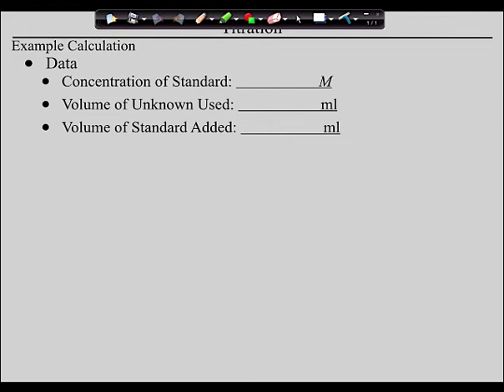All right, 2 years ago, I didn't have the money to buy these for my classes, and a couple of my AP students took the motor off of an old junked computer case, and they taped a magnet to it, stuck it inside a crayon box, plugged it into the wall, and made their own magnetic stirrer. Pretty geeky. All right. Anyway, so there you go. So now, of course, the question, right, is how do you get the bar back out?